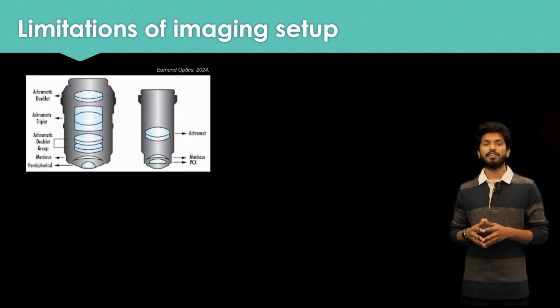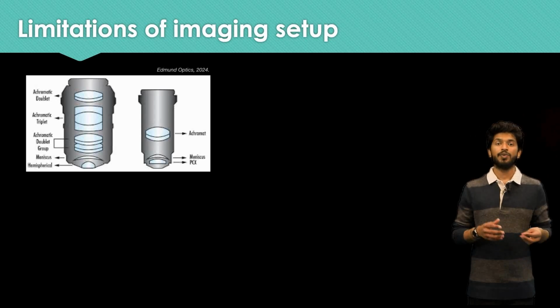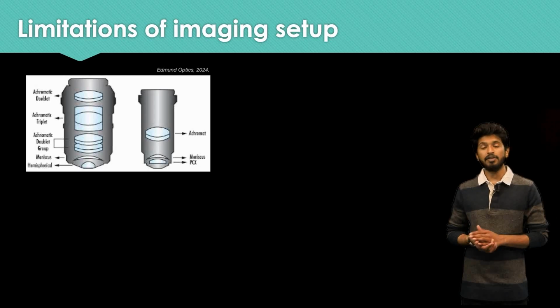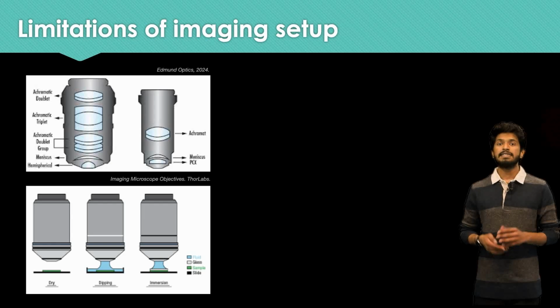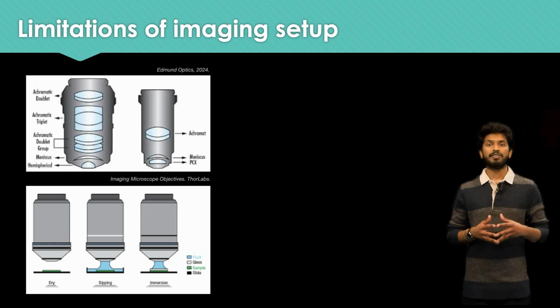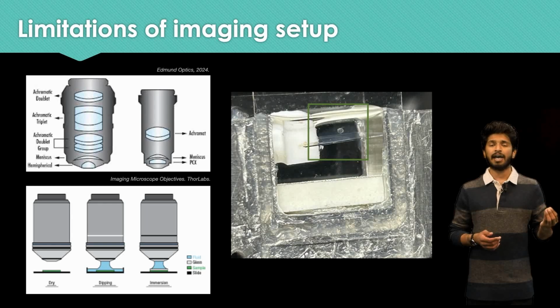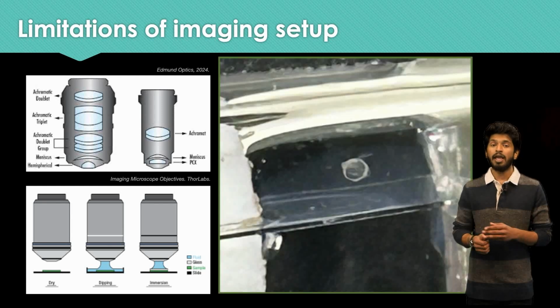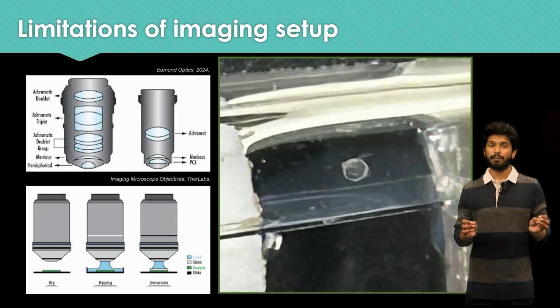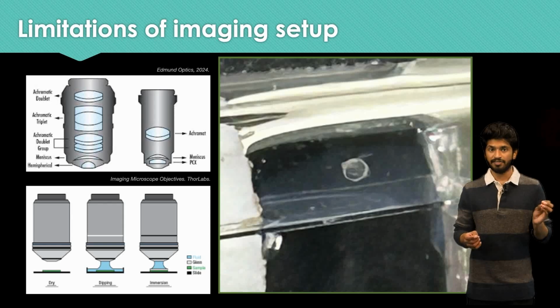It depends on if the required resolution could be reached using the specific objective, which could be immersed in the sample container, which might contain solution or not based on the objective. Secondly, the mounting style, if the sample needs to be recovered, needs to be very gentle to prevent any damage to the sample and interfere with the event. The mounting style could also damage the sample during the acquisition and shouldn't put any pressure on the sample, to observe the event in a stable manner without any external influence.